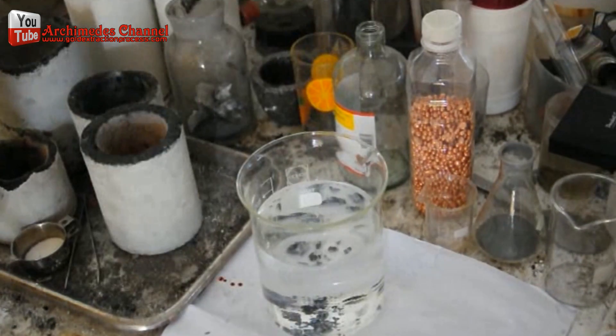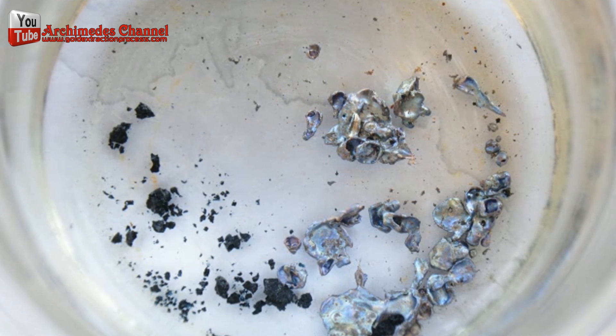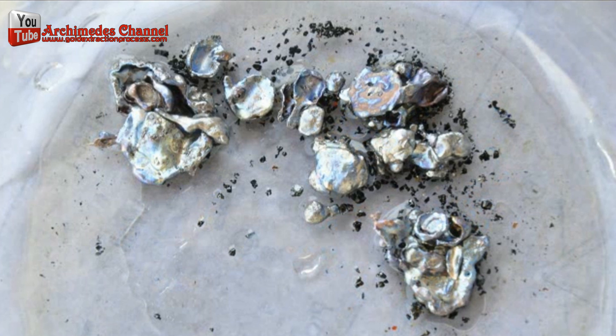Melt all metals together — copper melts first, then put in the gold and lead for a homogeneous melt. Pour the melted gold into water, broken down into smaller pieces to make it easier to use nitric acid to dissolve the metal that is not gold.